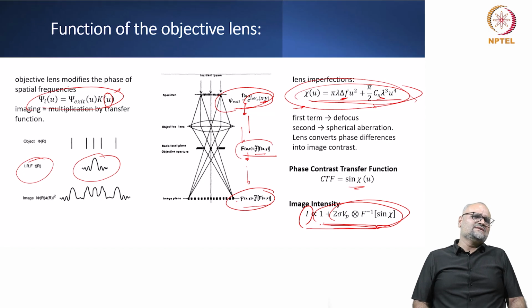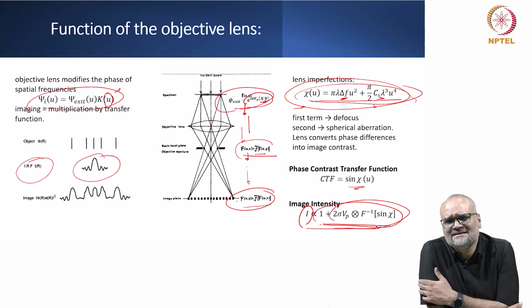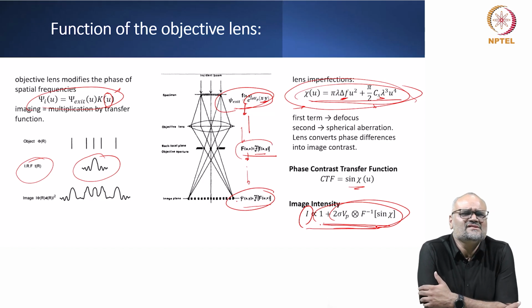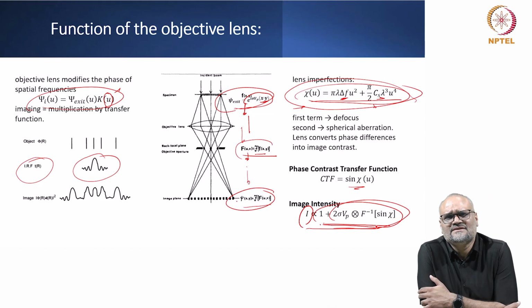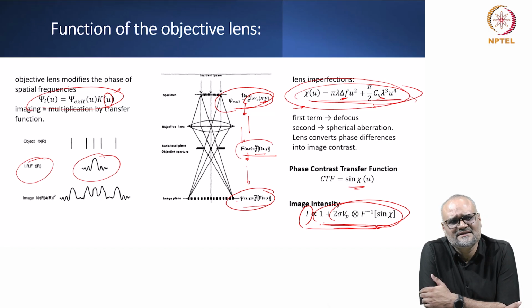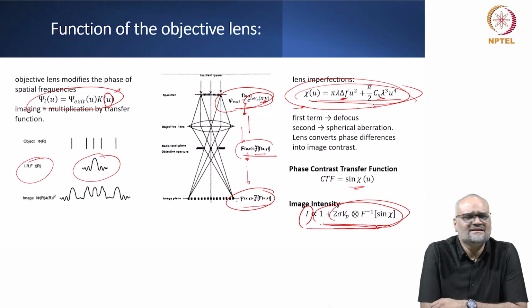Remember that the fringes that you are recording do not always directly correspond to lattice fringes. There could be cases where it directly matches the reciprocal lattice vector which is producing these fringes, and I can relate it to the structural information I get, but it is not always the case. So remember under which conditions you are recording the information and what these fringe patterns actually correspond to.